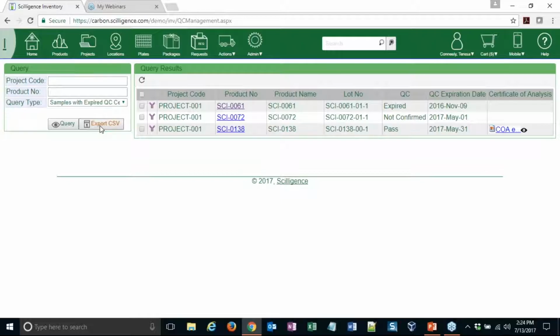And you can also print out a report, and it gets in an Excel file that you can open or send. Okay. So now we have covered all the items we wanted to bring to your attention today. I'll just move back to our slides.